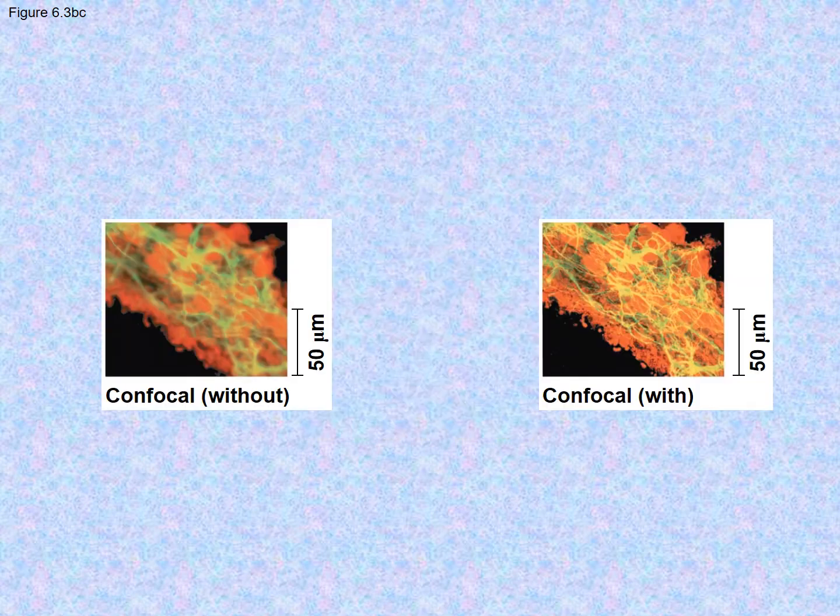Now, confocal microscopy. Here we can see standard microscopy, right? And then we have the confocal microscopy, which is quite interesting. It actually improves what might be considered out of focus with standard microscopy. It improves it to be a lot more in focus and a lot clearer, so you can see much more detail. Again, this is kind of three-dimensional as well.